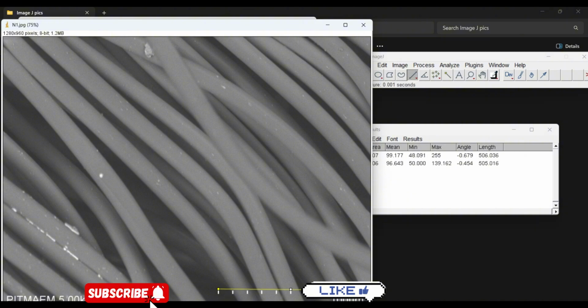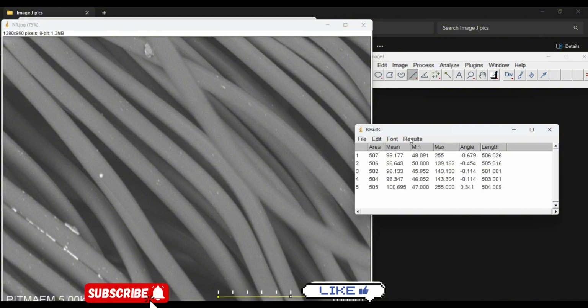This is another one, control M. See, there is a 1 pixel difference. So another third measurement, control M, and there is slight difference as well. So again, control M, this is fourth, and again control M here, this is the fifth one. So we have 5 measurements here.